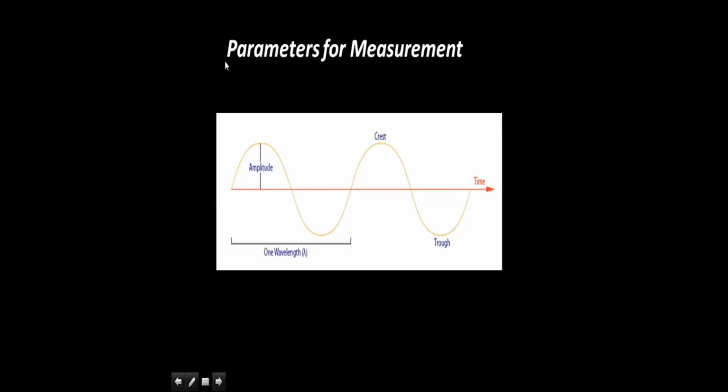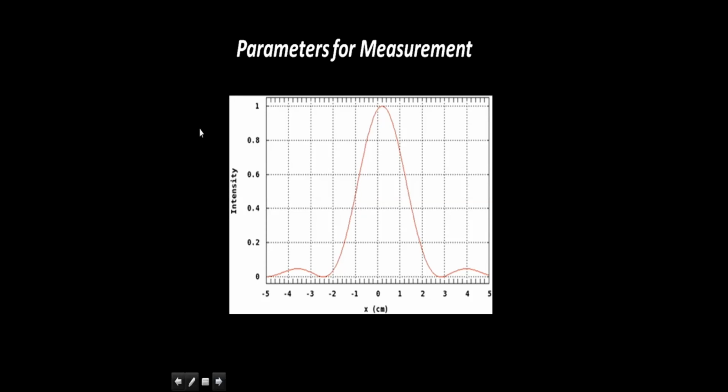There are two most important parameters that are measured during the emission process. The first one is the wavelength of emitted radiation. This wavelength gives the identity of the element which has emitted the radiation. The second most important parameter is the intensity of radiation, which is proportional to the number of atoms present, that is, to the concentration of the element. Intensities received from the optical system are converted into electronic data and interpreted by means of a readout system.